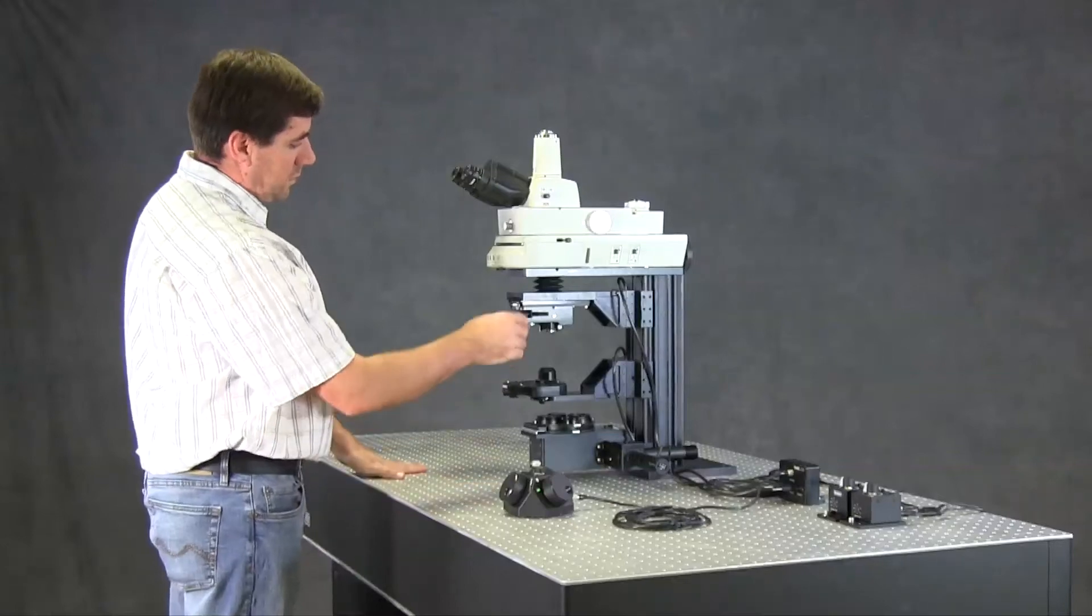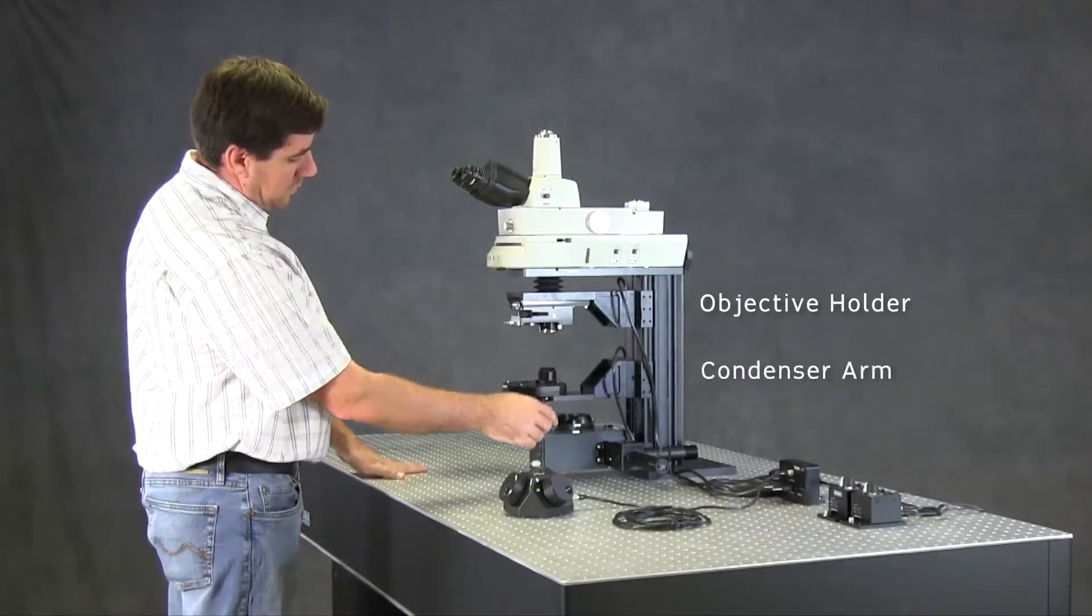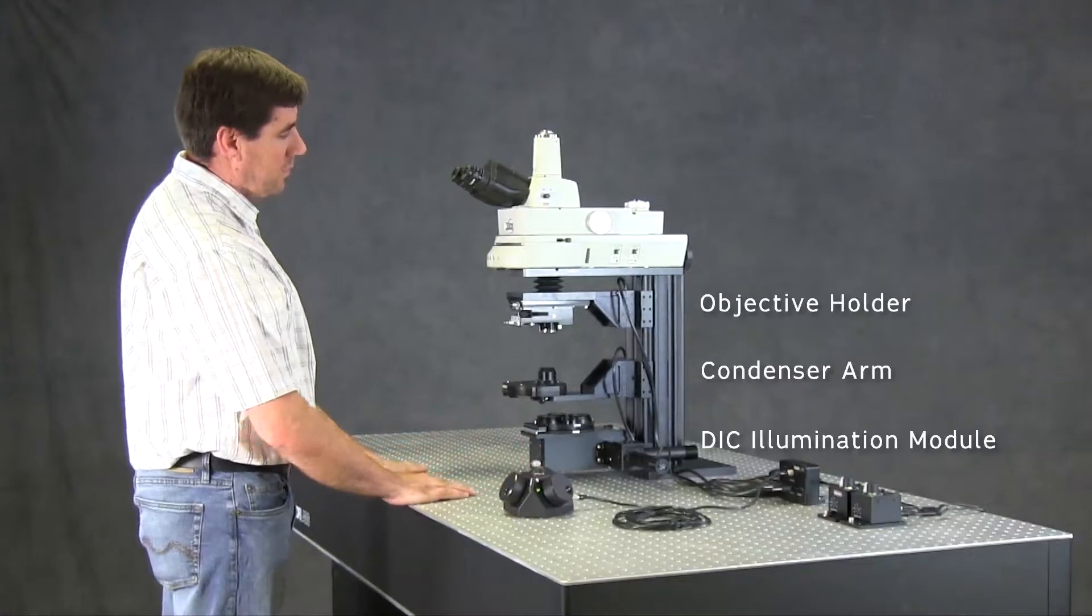This microscope is equipped with a dual objective holder, condenser, and DIC module with visible and NIR LEDs.